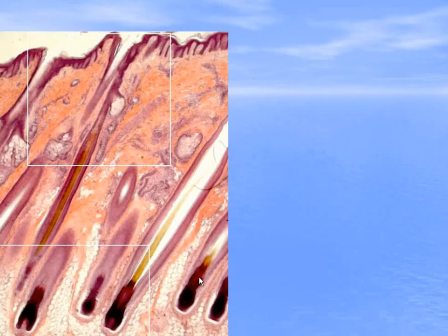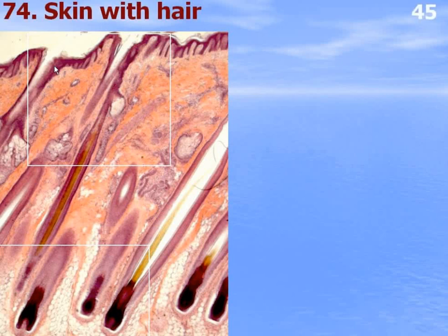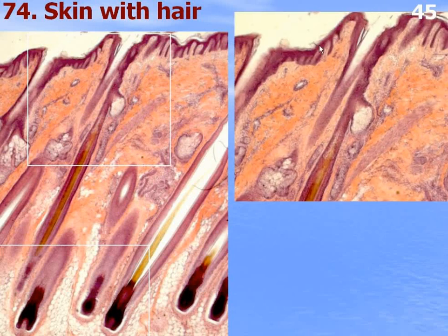Skin with hair — it's thin skin. The epidermis is very thin. There is also dermis and hypodermis — adipose tissue, also called subcutis. In thin skin, the epidermis consists of four layers.